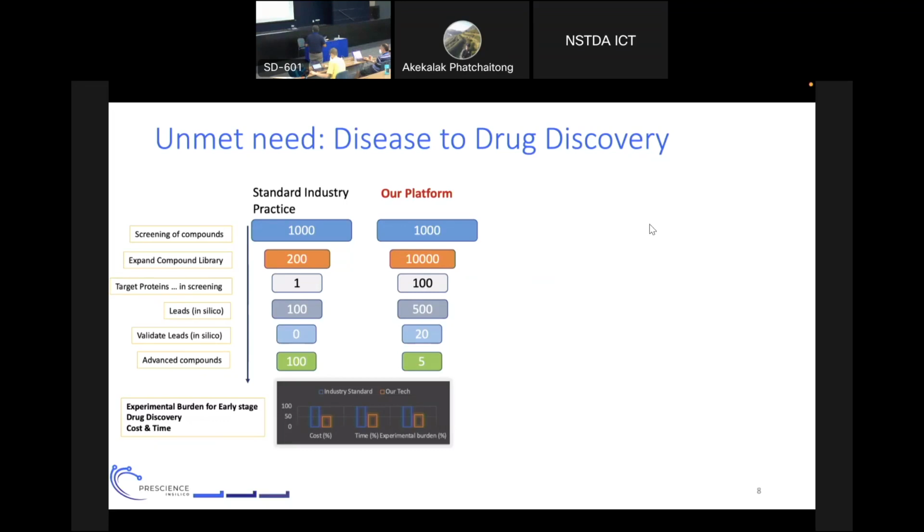Not only that, in the software, we are not approaching only one target, right? I'll give you an example of kinase. If you are working on kinases, there are thousands and thousands of kinases. And experimentally, people do kinase assays, right? 4,000 kinase assays is quite common. Why? They're not only looking at a target, they're also looking at off targets. So the kinase molecule should work for a particular kinase for that disease.